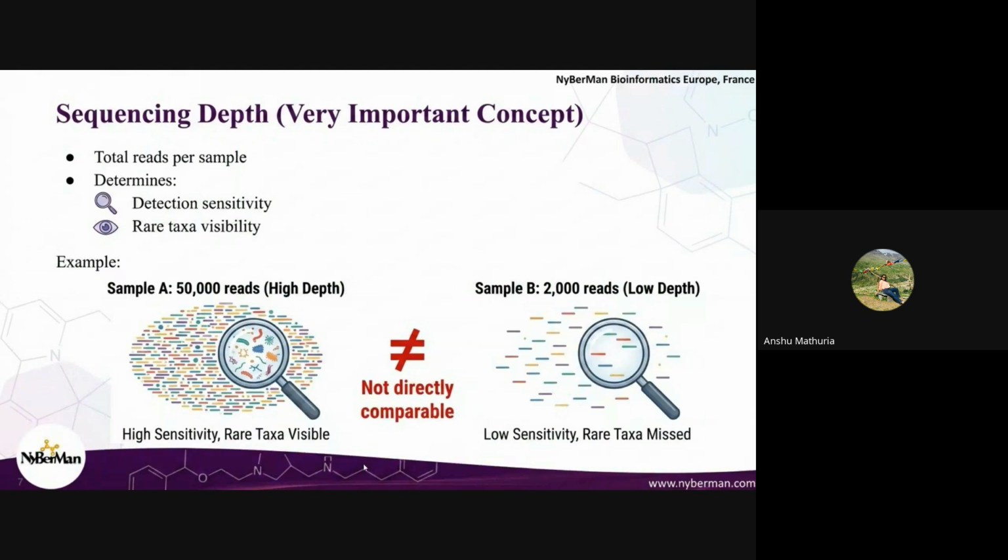But when we are doing a de novo sample, where you don't know what organisms are present, what the already existing inhabitants of that particular sample are, then to avoid false results, we need to compare in a normalized manner. We can't directly compare it because the read depths are very different. So we need to bring it down to a normalization factor, normalize, and then look into them so that we can get a proper decision.